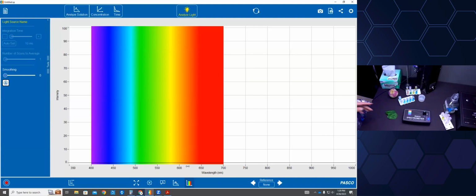So what I've got hooked up here is a fiber optic cable. Here's one that's unplugged from the sensor, and I'm going to use the visible spectrometer to figure out what the unknown element in this emission tube is. So I've got that on, and you're looking at that, and you're like, I can tell what it is by the color. But let's use some quantitative data.